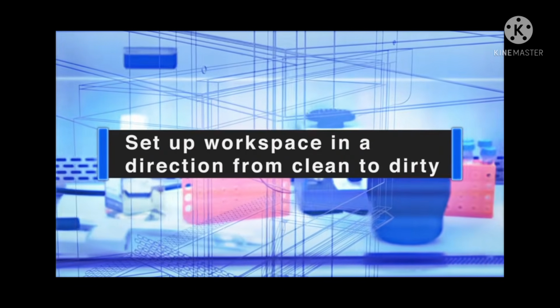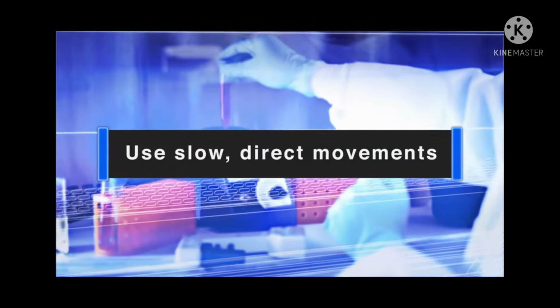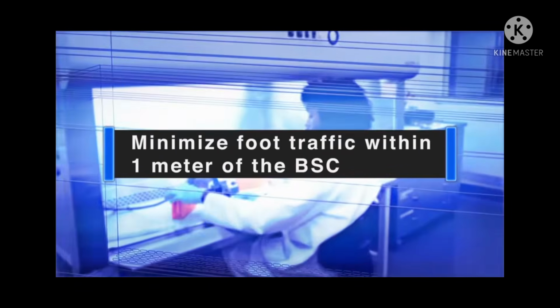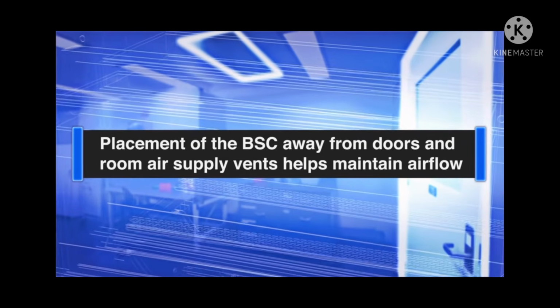Set up workspace in a direction from clean to dirty. Use slow, direct movements. Minimize foot traffic within 1 meter of the BSC. Placement of the BSC away from doors and room air supply vents helps maintain airflow.